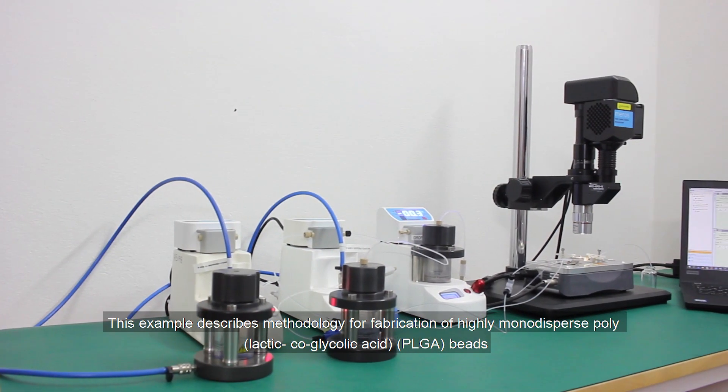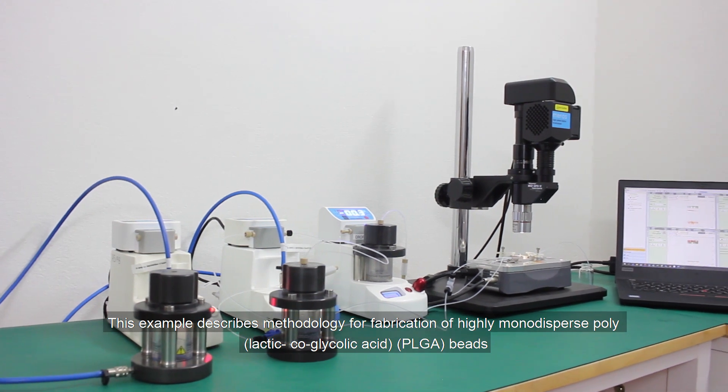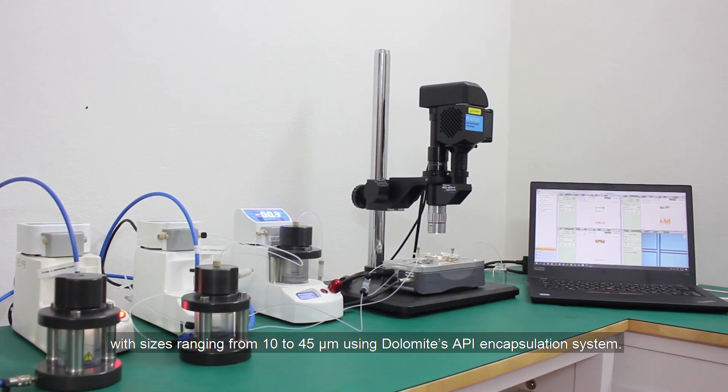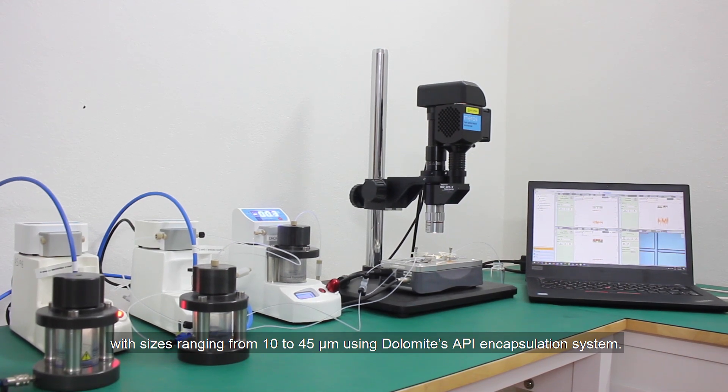This example describes a methodology for fabrication of highly monodispersed PLGA beads in the size range from 10 to 45 microns using Dolomite's API Encapsulation System.